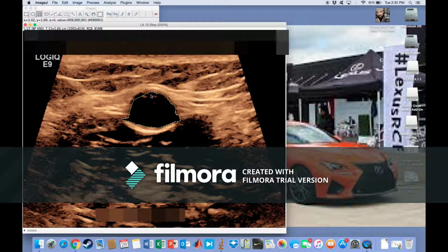And then once you get back to that set position here at the end with that box that was shown, it kind of closes it off for yourself. So knowing that I did a very long stroke here, I can actually move these little vertices and place this here so that I can get a better reading of my actual image itself. So although you think you might have made a mistake, it's totally fine. You're able to adjust this at the end, so you don't actually have to start over, which is one of the biggest things that I love about this software.